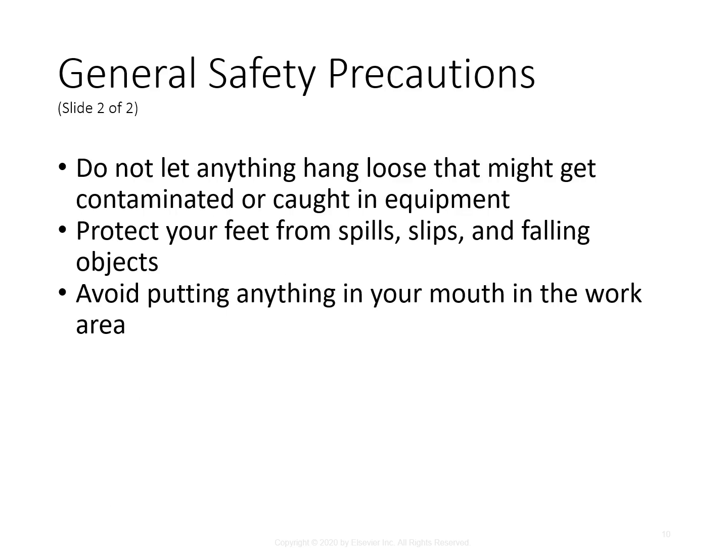Make sure you don't let anything hang loose that might get contaminated or caught in equipment. An example of that would be an ID badge on a lanyard. They don't really allow those anymore for this very reason. And also make sure if you have long hair to keep it pulled back as well.